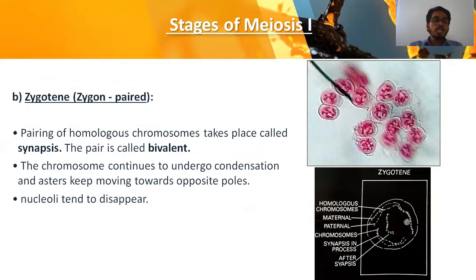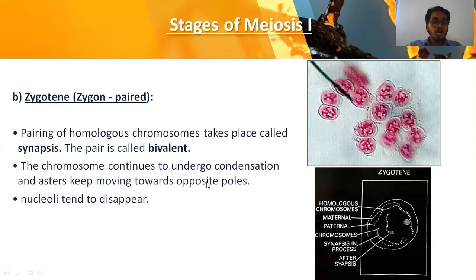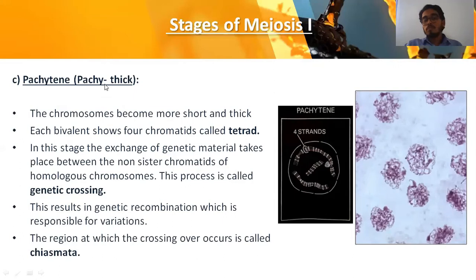In zygotene, the chromatin network continues condensing and becomes more thickly visible compared to leptotene. The pairing of homologous chromosomes takes place — this pairing is called synapsis. The pair is called a bivalent, meaning two similar chromosomes present side by side. This process of pairing is synapsis. The chromosomes continue to undergo condensation, asters keep moving toward opposite poles, and the nucleolus tends to disappear. This microscopic view was taken under 40x magnification, giving 400x total magnification.